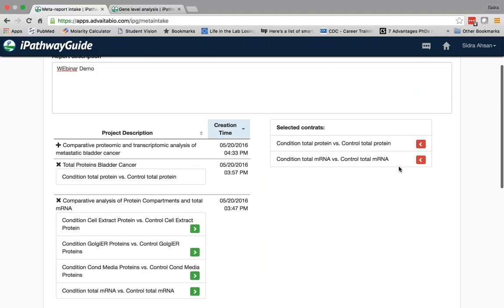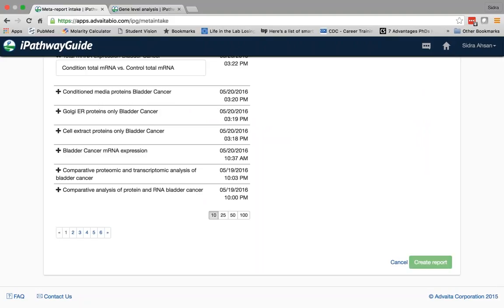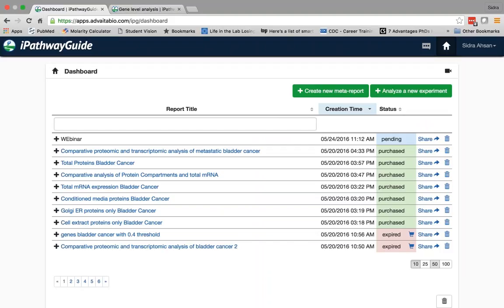And now I have added the selected contrast that I want to look at, and then I can click on Create Report here. It takes anywhere from a minute to 2 or 3 minutes for this report to generate, and you can see the status for that in the dashboard. And you'll also receive an email as soon as the meta-analysis report is created.